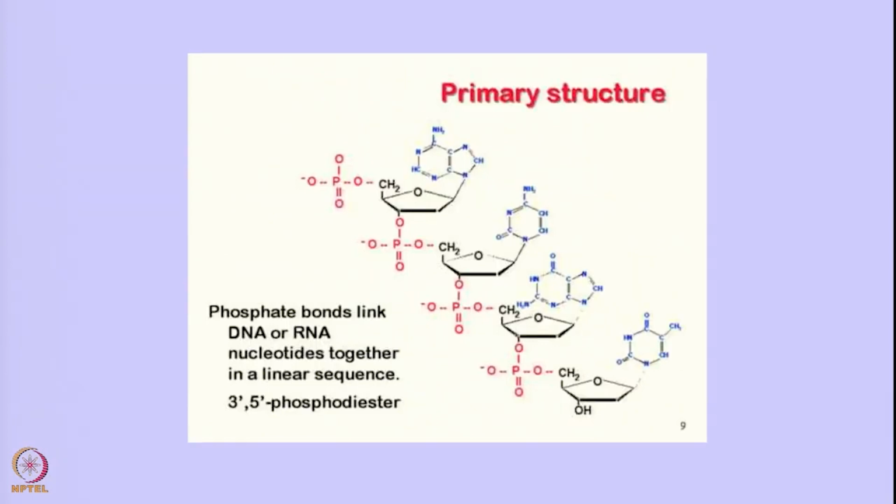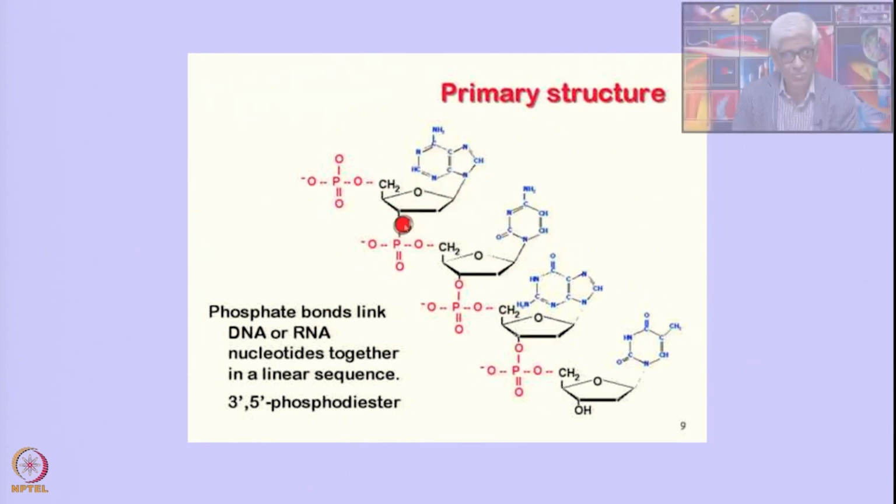So now this is a kind of a summary of what I explained for so long, and that is the primary structure of the DNA or the RNA. So this sequence goes like this. As I indicated earlier, you have a base here and this is the ribose ring or the deoxyribose ring, whatever. Only the carbon skeletons are shown, the protons are shown only for the CH2 groups here, but there are protons here and protons there, those ones are not shown, okay.